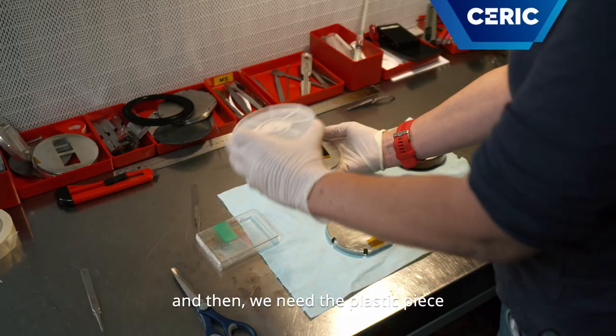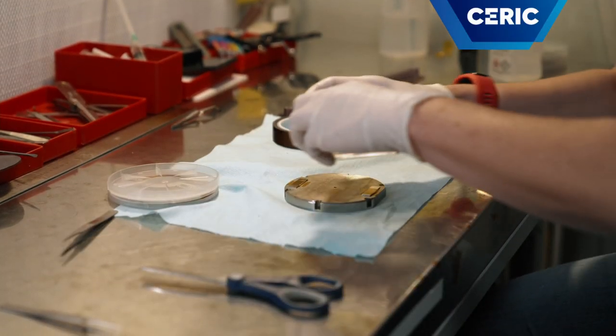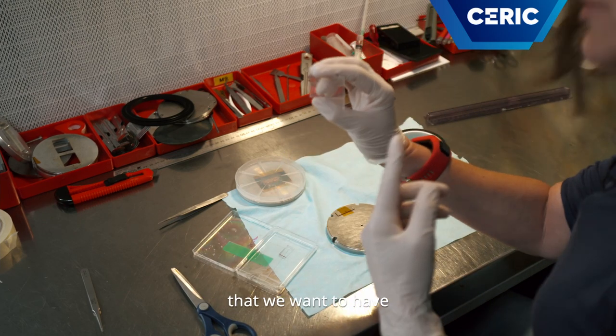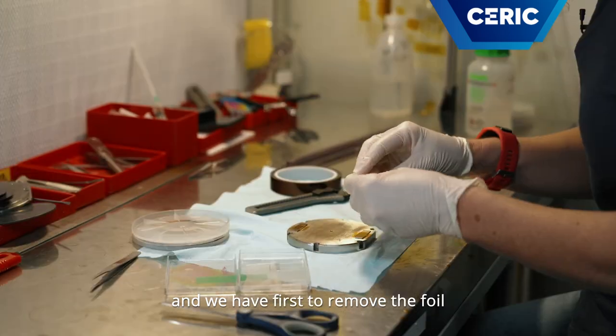And then we need the plastic piece that will be mounted on the sample holder. So this is the piece of plastic that we want to use. It is covered on both sides with a thin foil to protect it, and we have first to remove the foil.